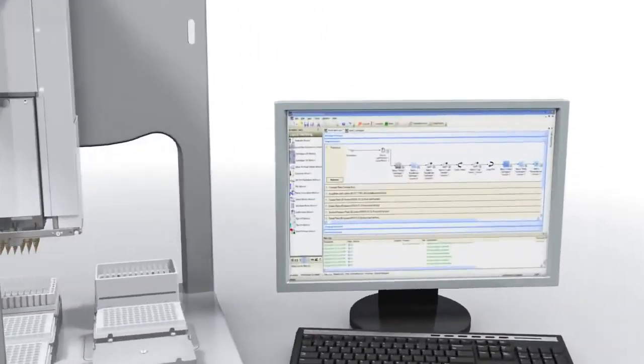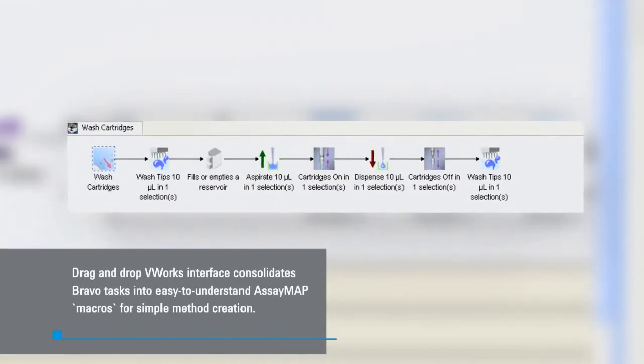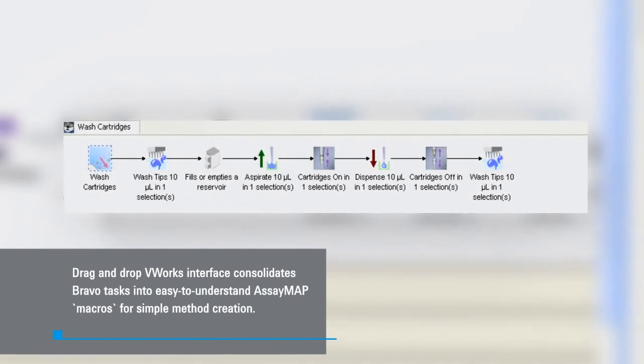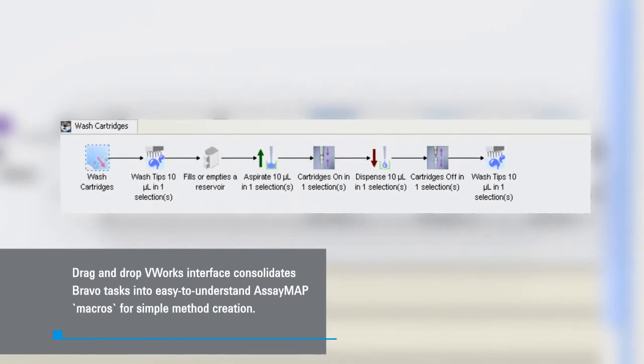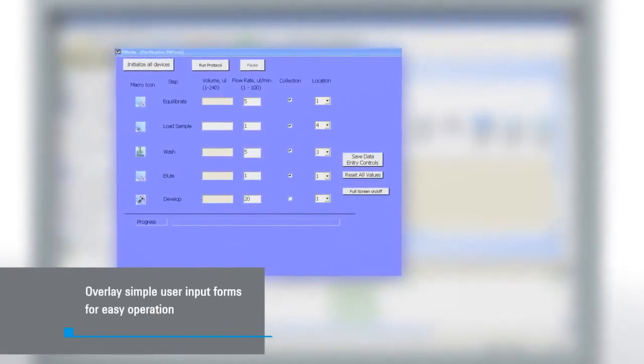The platform is controlled by the Agilent V-Works automation control software. The V-Works graphical user interface consolidates Bravo tasks into easy-to-understand AssayMap macros for simple method creation while allowing for application-specific adjustments to liquid handling parameters, such as flow rate and volume. With V-Works, you can create simple user input forms for easy operation.